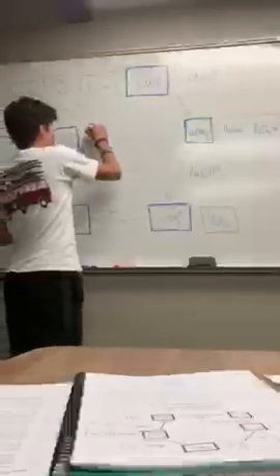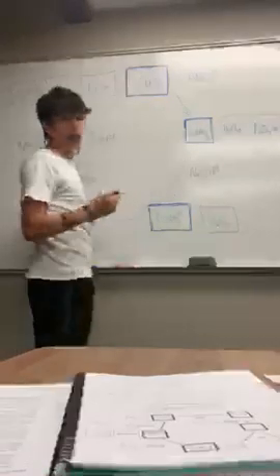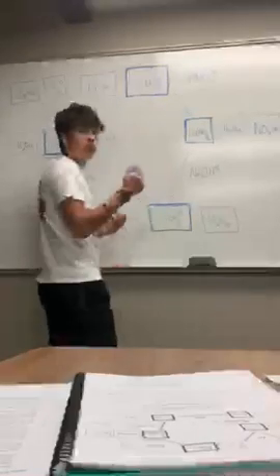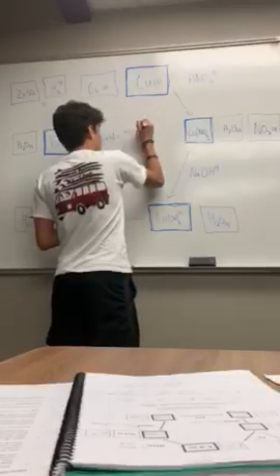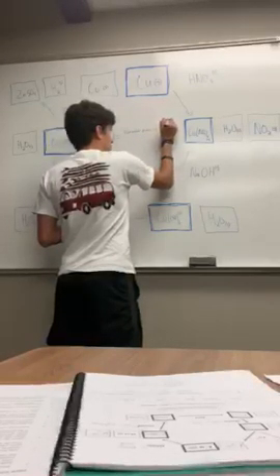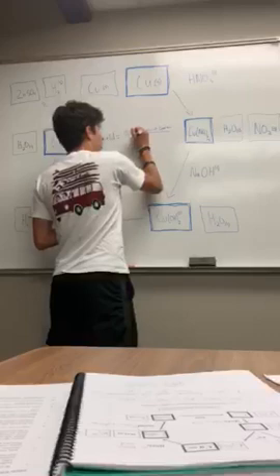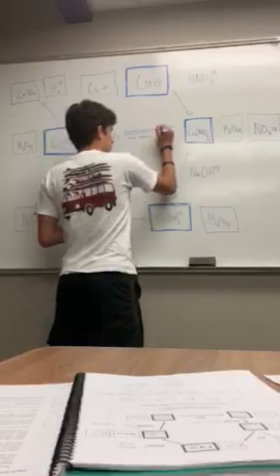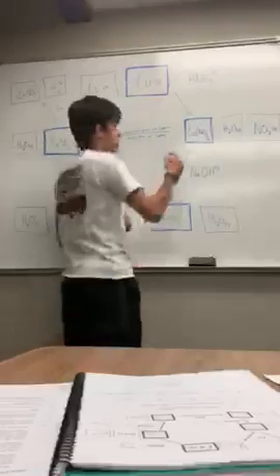So percent yield is going to be the mass of the copper that was measured at the end of the experiment, over the initial mass of copper to begin the experiment. And you would multiply that by 100 to find percent yield.